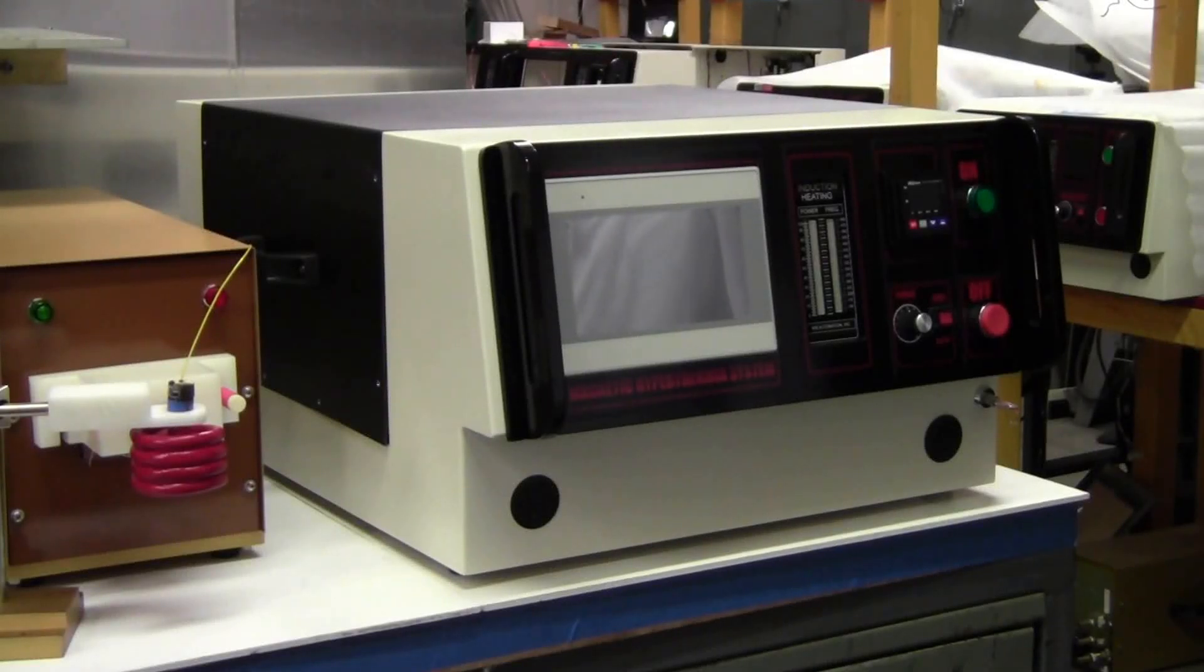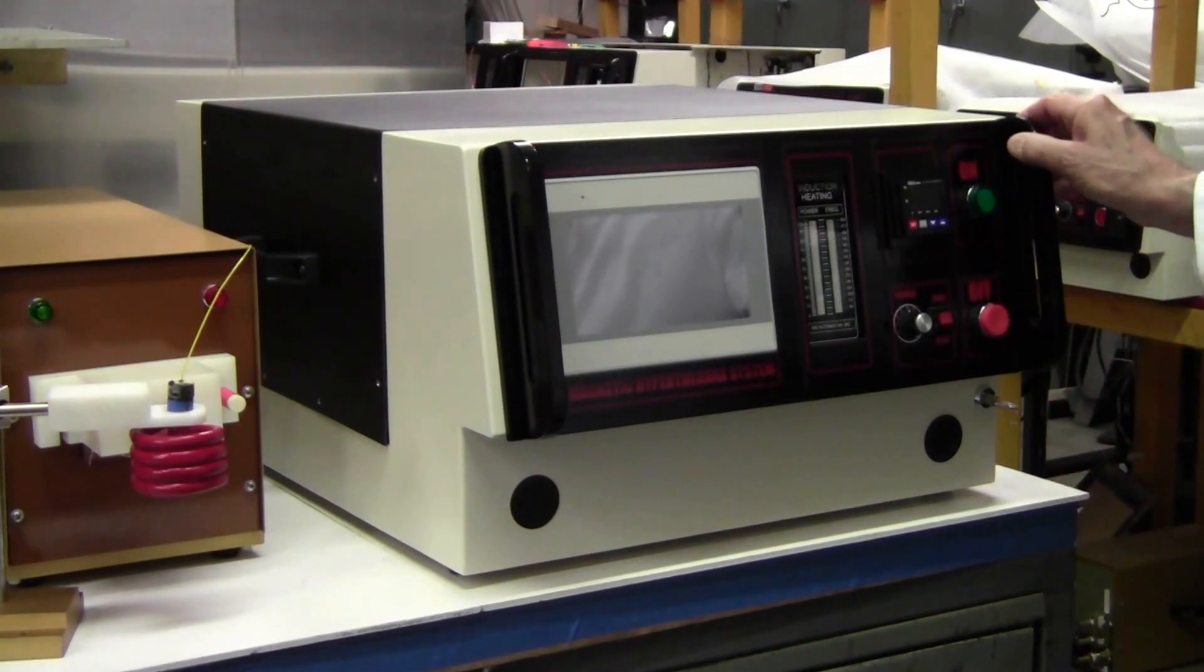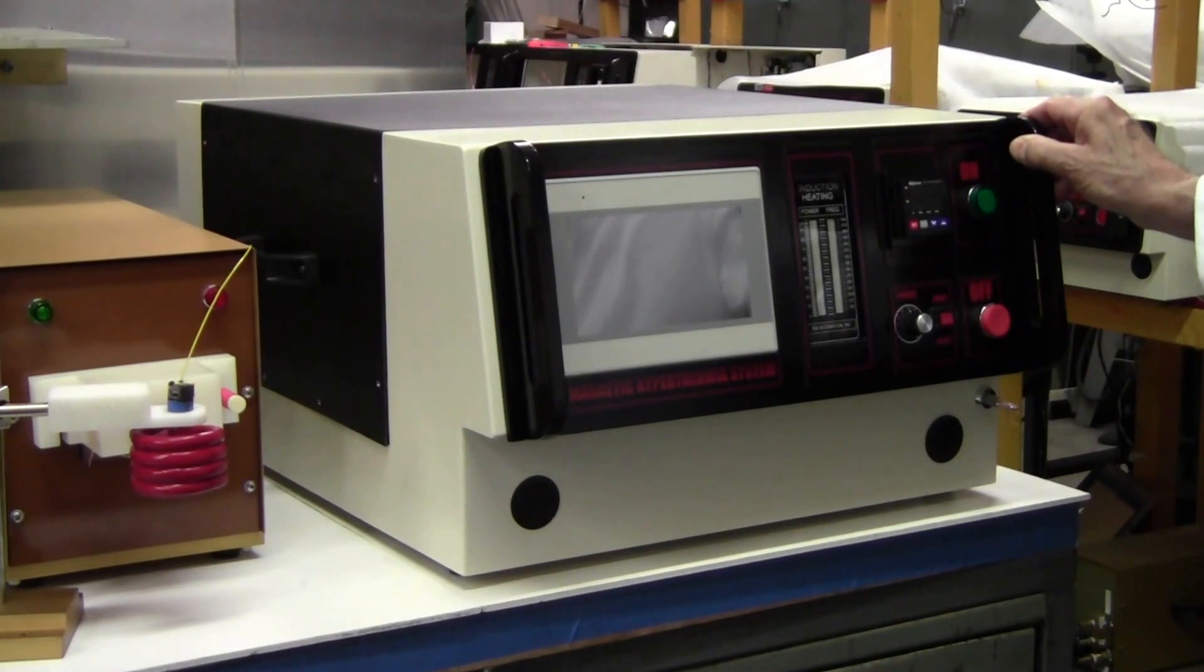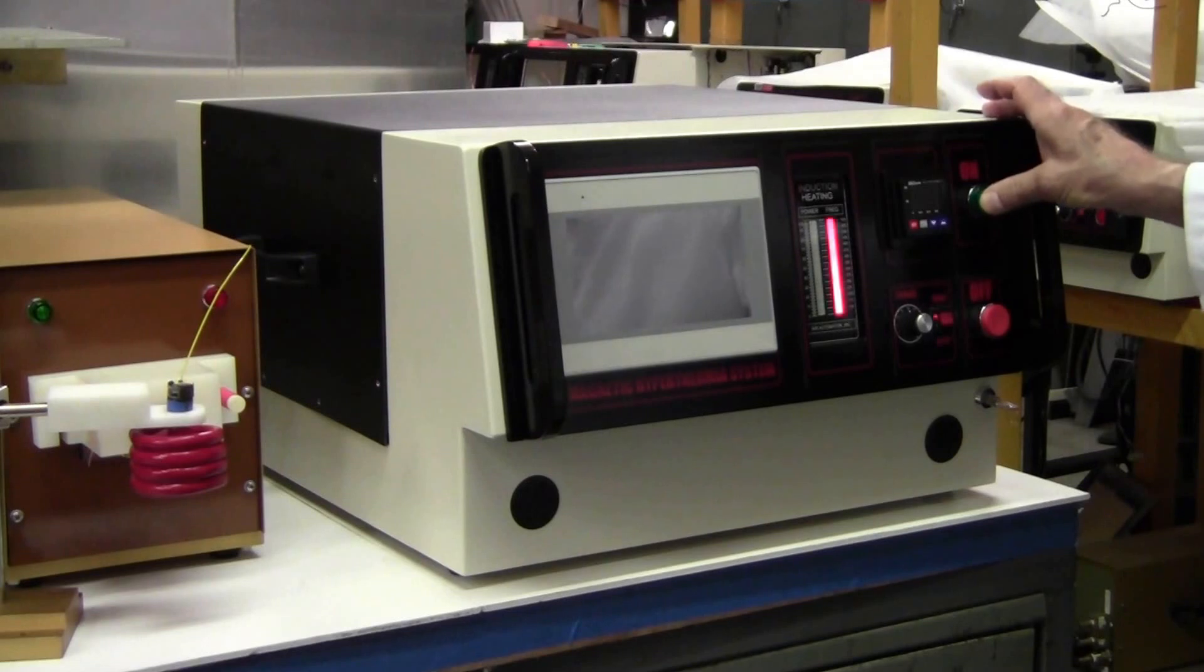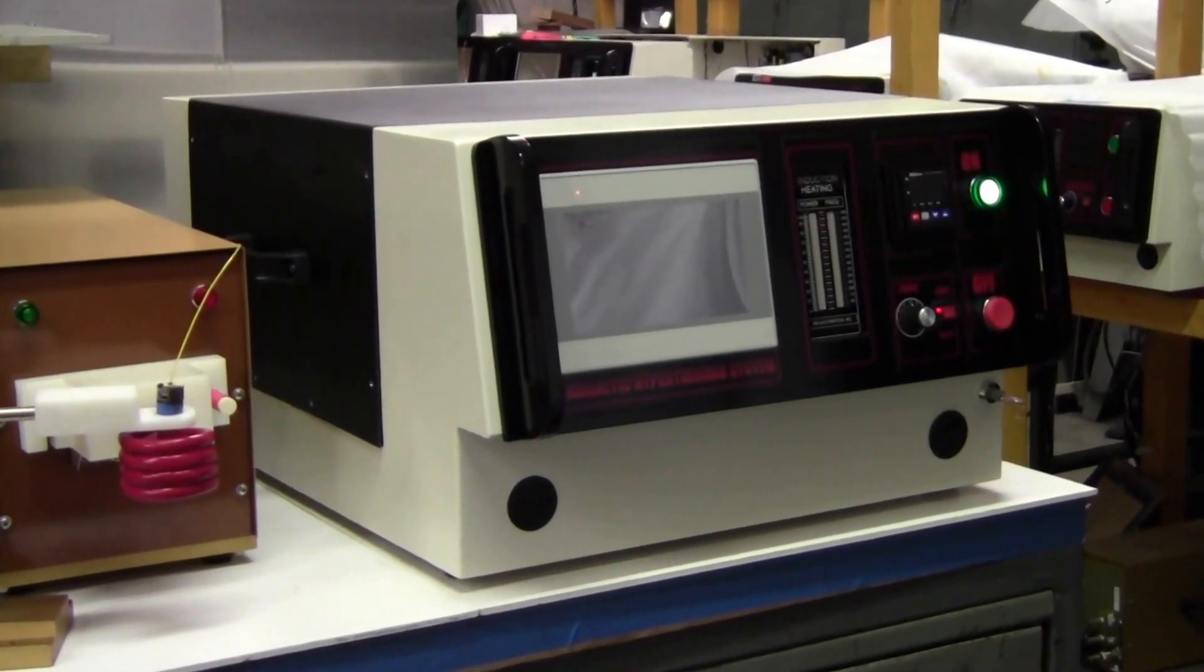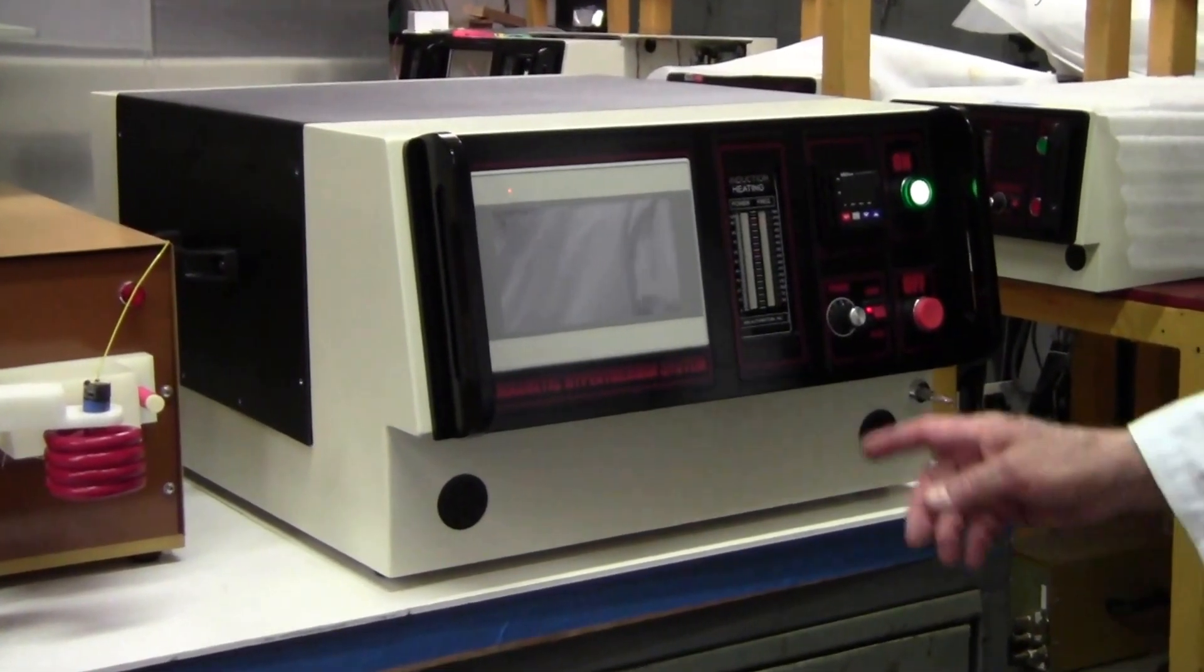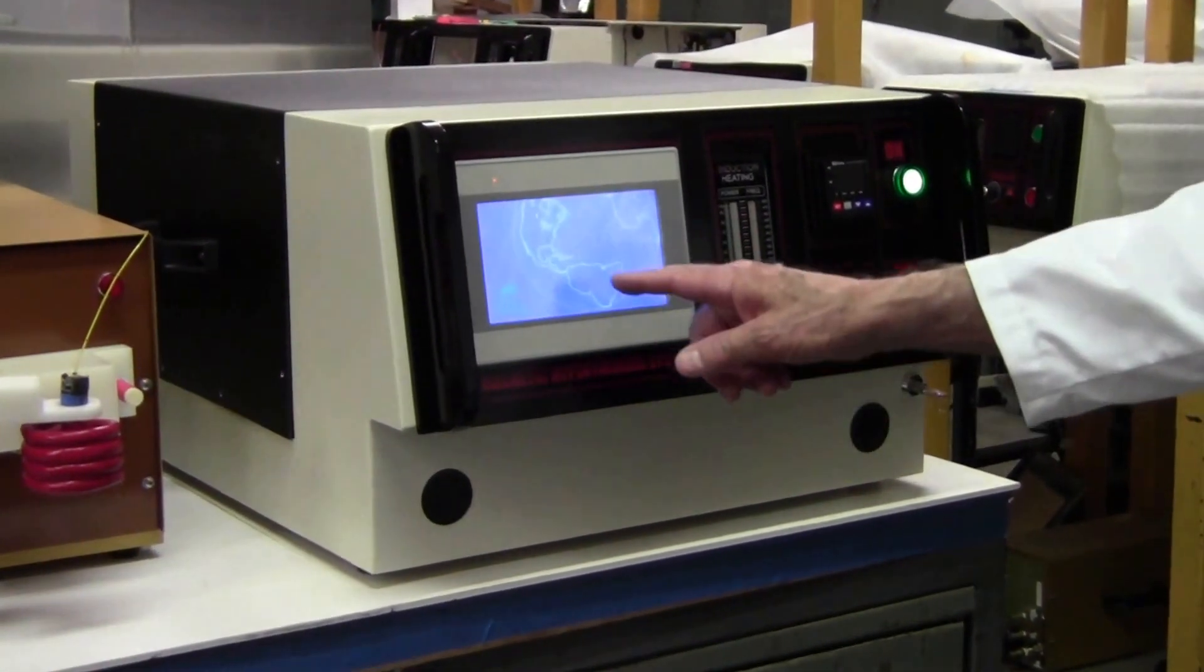This is an MSI automation magnetic hyperthermia instrument, and what we'll be demonstrating is heating and some of the controls that you have. I'll press the green button and that turns on the machine. Now it will go through a startup procedure. First, it'll turn on the color touchscreen.